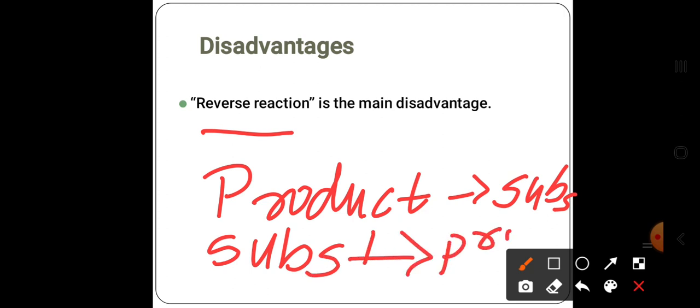Here, if the alkaline condition is not maintained, or parameters such as temperature, molarity or buffer solution are not properly maintained, the reverse reaction can take place. Here the chances of reverse reaction are there.